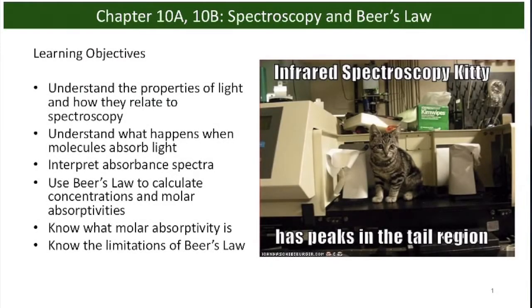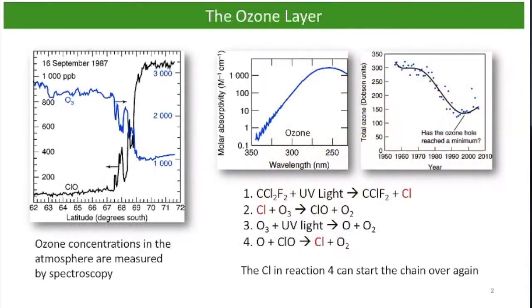This video is going to be about spectroscopy and Beer's law. Spectroscopy is a very common analytical technique for determining concentrations of analytes in various matrices. Most common would be in the gas phase or in a liquid phase.